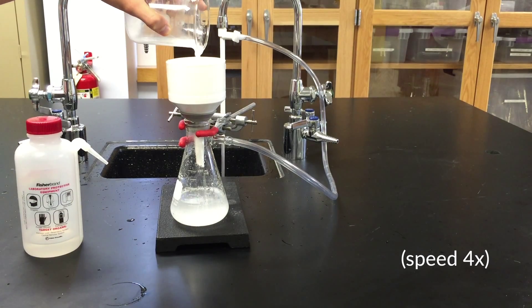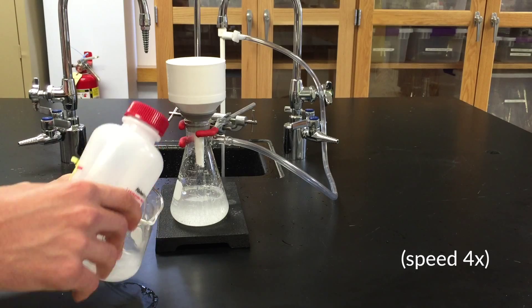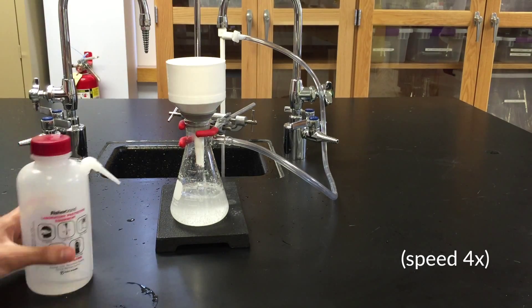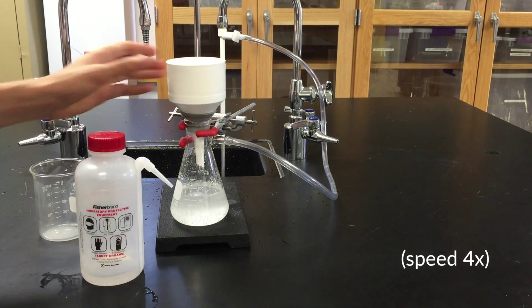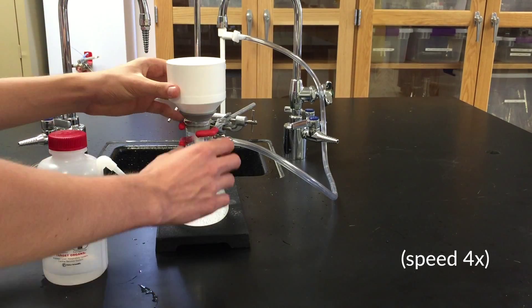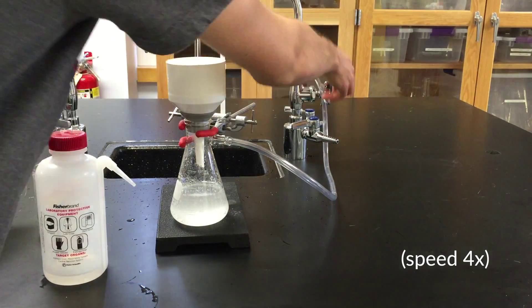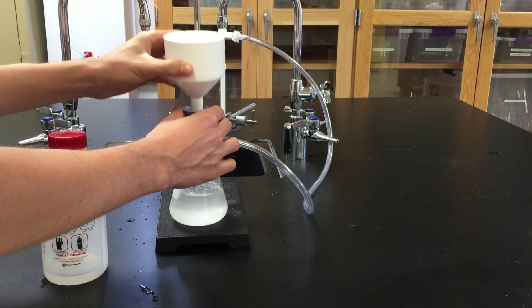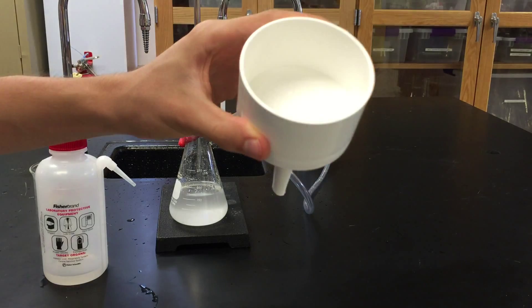Rinse the filter paper with water periodically to push through any soluble substances trapped in the precipitate. Once you're done, turn off the water. You can see that what's collected on the filter paper is the dry precipitate.